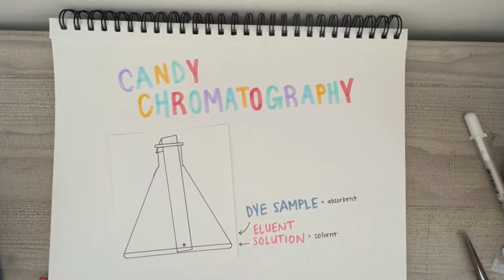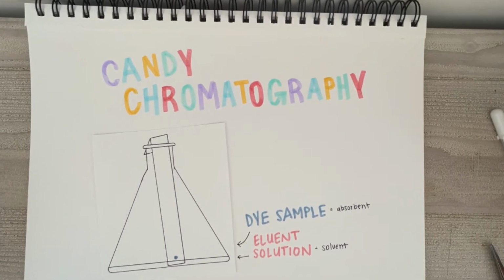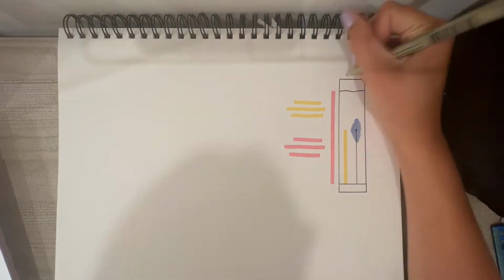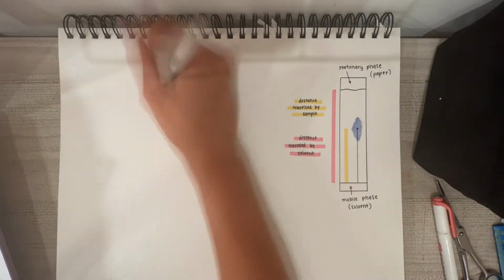The absorbent is the compound that is separated by this process, and the eluent solution is the liquid that carries the absorbent particles up the strip to be separated. This is what a finished chromatogram looks like. The stationary phase at the top of the strip is just paper, and the mobile phase at the bottom of the strip is entirely solvent below the dye sample.